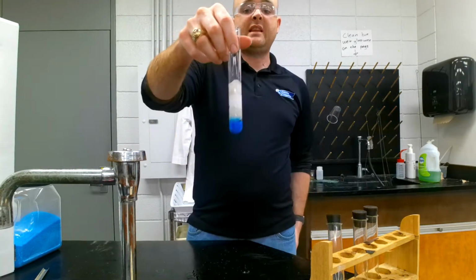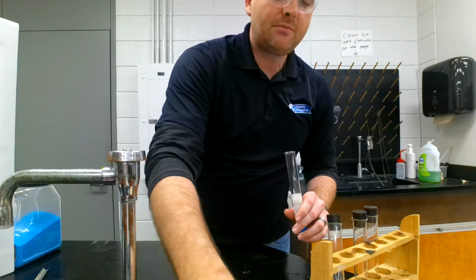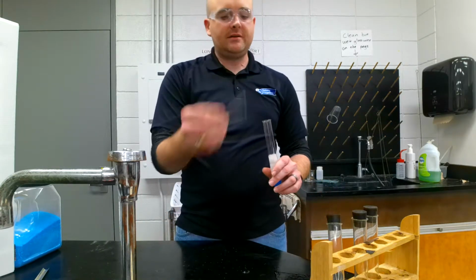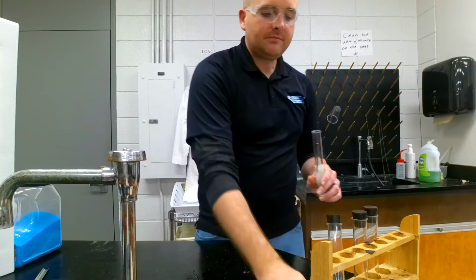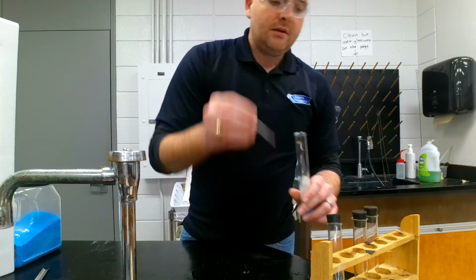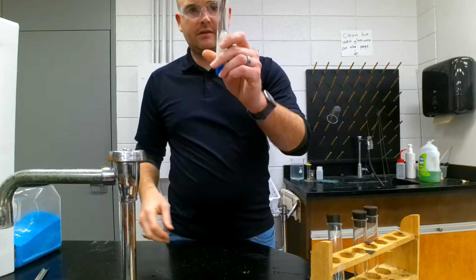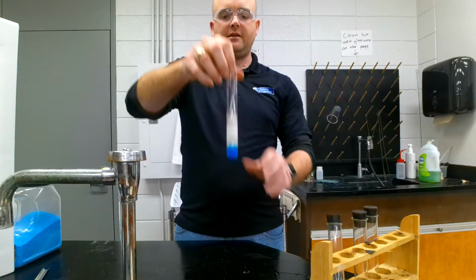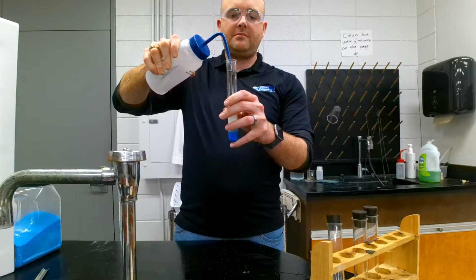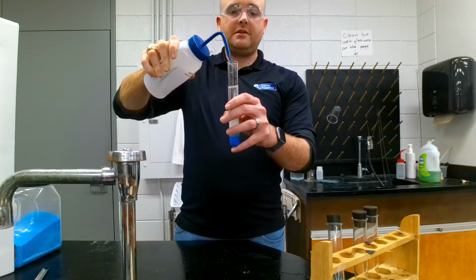And then the last piece is the copper. By itself it might be fine, but let's see if we'll take some iron, and we're going to put these on top. So let's go ahead and put 3 nails in there and stick those in there. And one of them is bigger than the other. That's alright. We'll get those in there, and they're going to be right on top. Now before we close it, we're going to add water all the way up to cover the nails. And these are your initial observations.